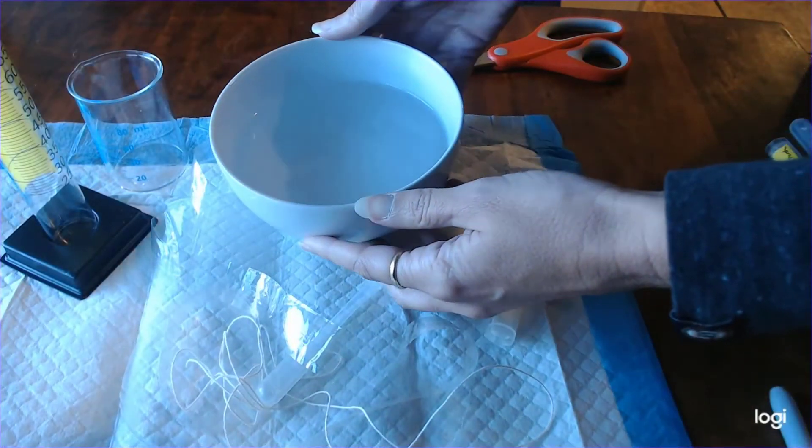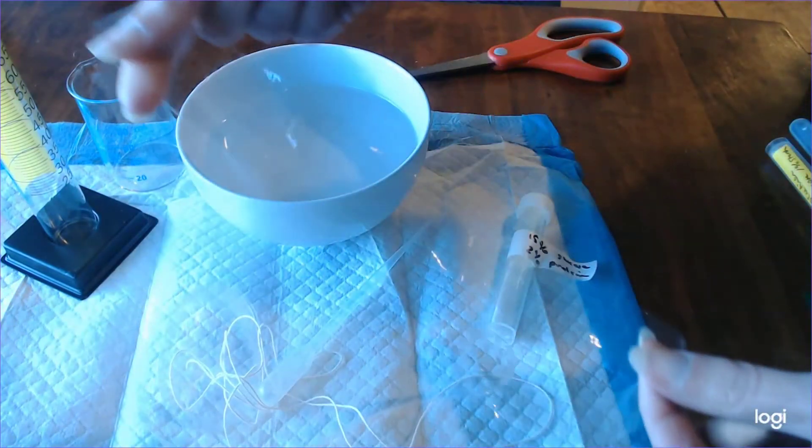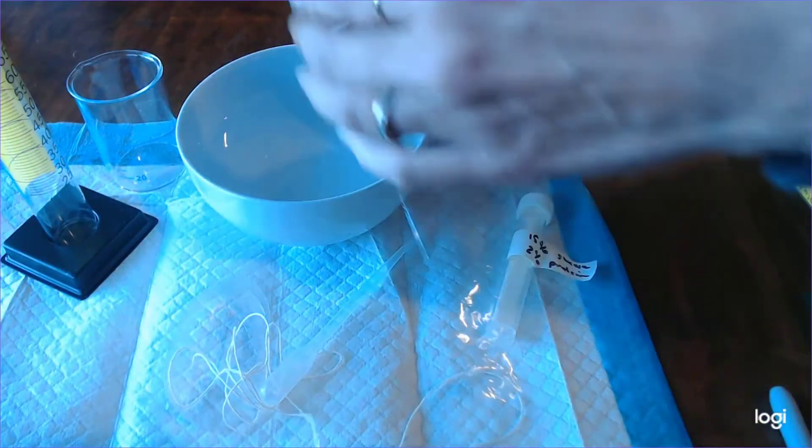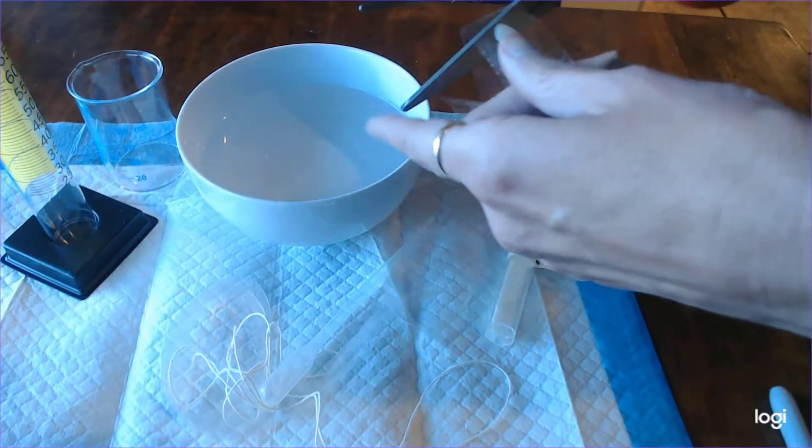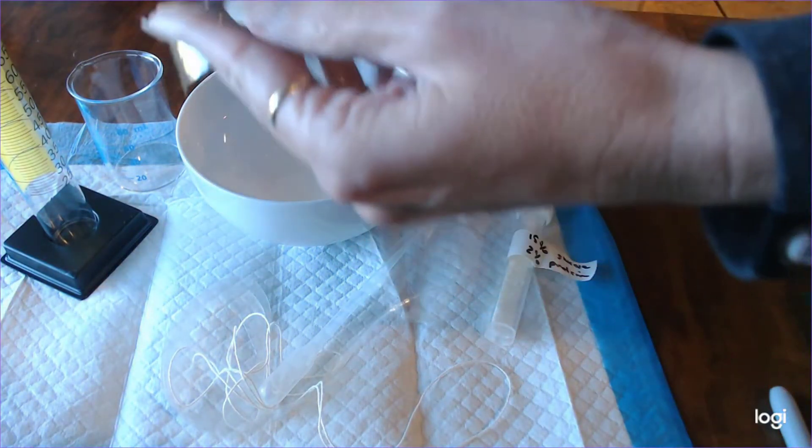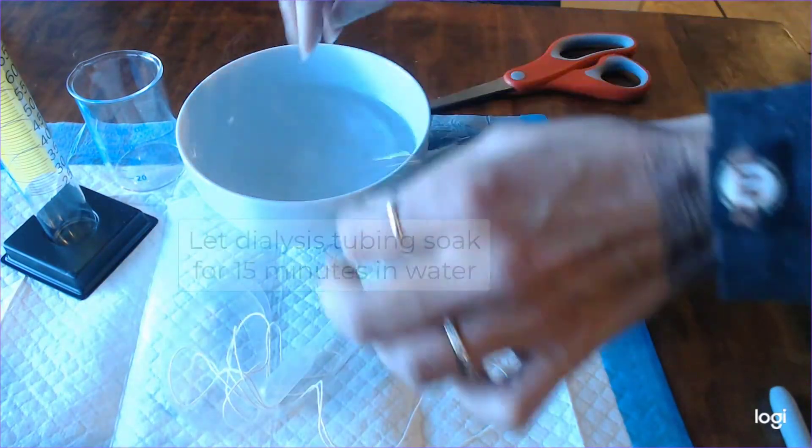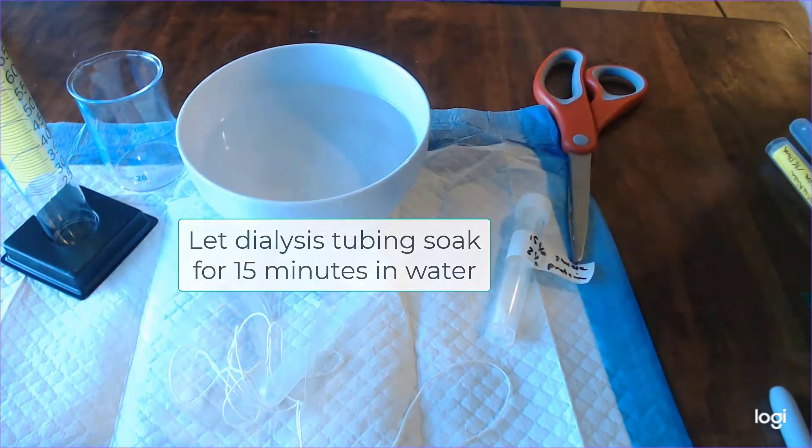The first thing to do is to soak our dialysis tubing. The tubing actually doesn't look like tubing when we first get it. It's dry and it looks like ribbon but you're going to go ahead and find this in your plastic bag labeled dialysis and you're going to cut off about a 6 to 8 inch strip and then you're going to soak it in a bowl of tap water and let it sit there for about 15 minutes.